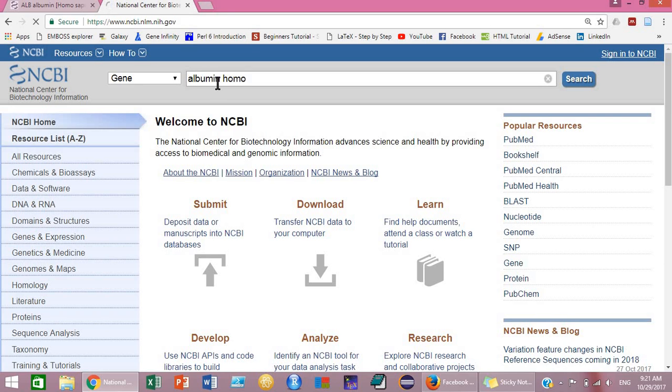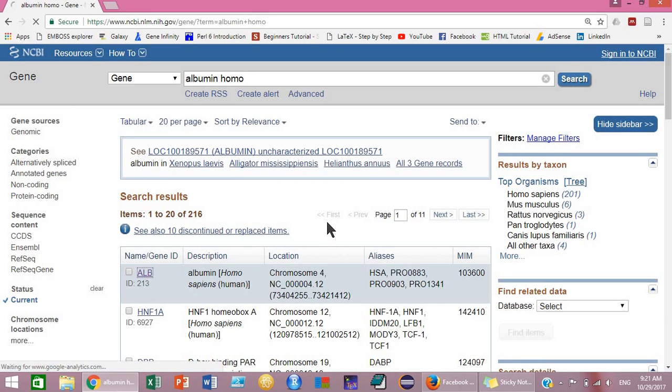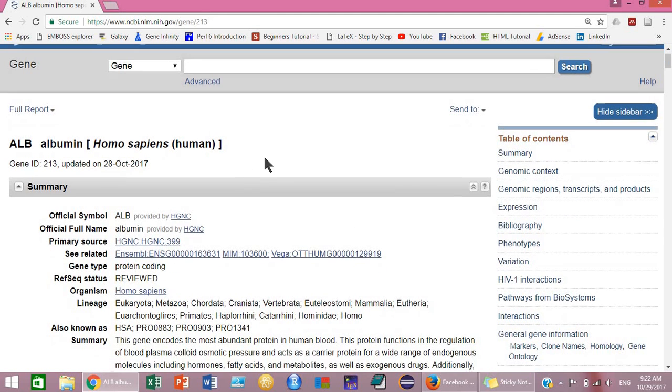Albumin, Homo sapiens. Search for it. This is the Homo sapiens albumin gene. Click on this gene ID. Once you click on the gene ID, this page will be opened in a moment.